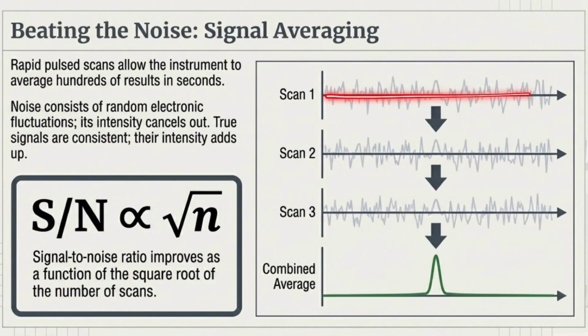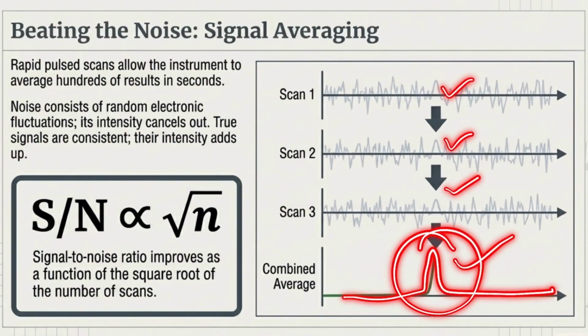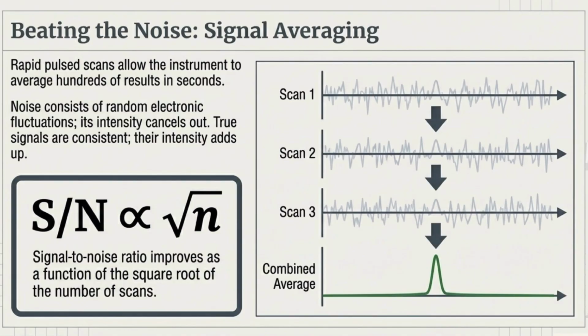So what we do is one scan, a second scan, and a third scan, and then from these scans we remove the noise. How do we remove the noise, or how does the system identify that a particular signal is noise? For example, you can see here that this is the peak, this is it appearing a second time, and this is it appearing a third time, and we sum up all these scans and finally we get this peak, and this peak finally shows in the spectrum.